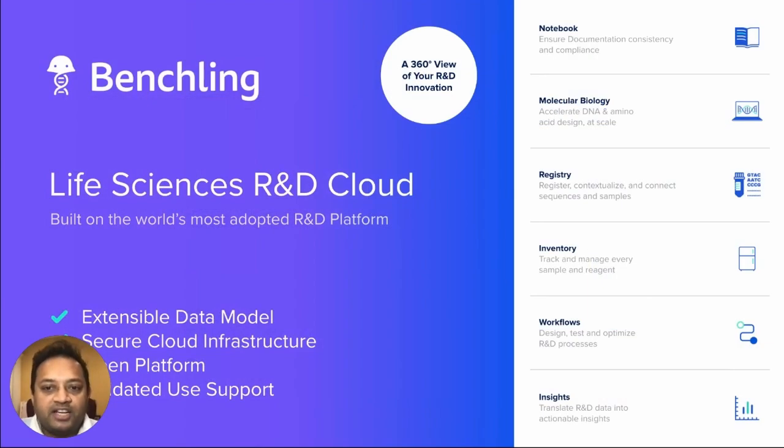Benchling offers a unified suite of applications built on a trusted cloud platform that addresses the needs of R&D teams across workflows that are experimentally driven, sample driven, and procedurally driven. Benchling supports the distinct needs of bioanalytical development by supporting exploratory hypothesis-driven research, controlled protocol-driven development, and lockdown procedure-driven execution, all on the same platform. So, going back to the poll of the audience, since most of you were interested in about two or three of the ways of doing R&D, Benchling is suited for doing all three in one platform.